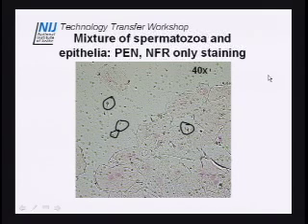Sorry, what was the staining called? Oh, the slide itself, it's called a polyethylene naphthalene slide. And don't get me to spell naphthalene. But that's the type of slide that you have to buy in order to use a Leica microscope. It's a glass slide, but it has a film that's glued around the edges.